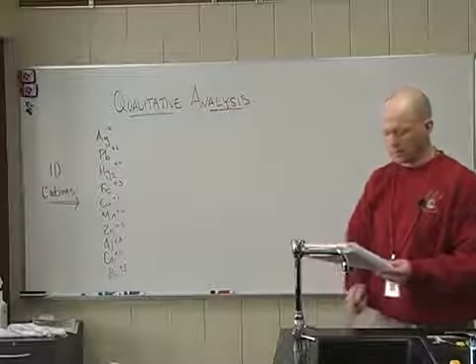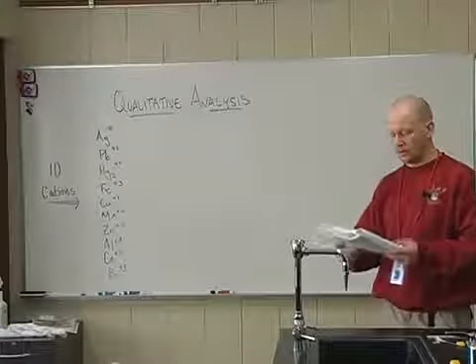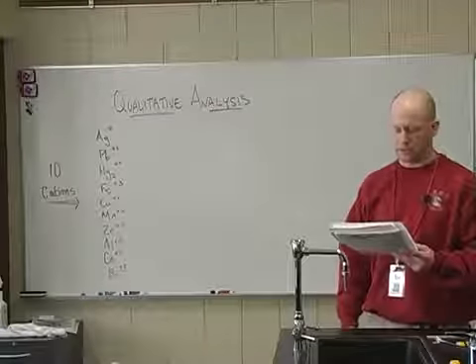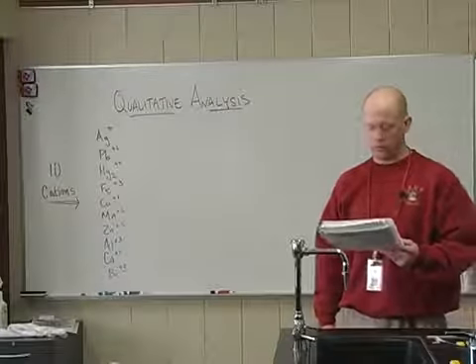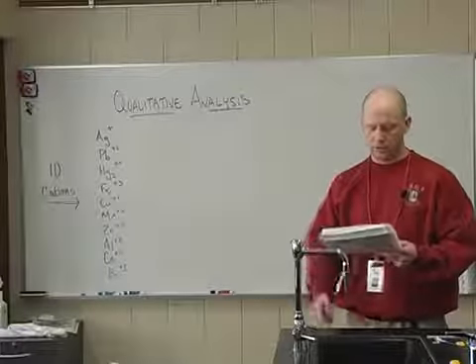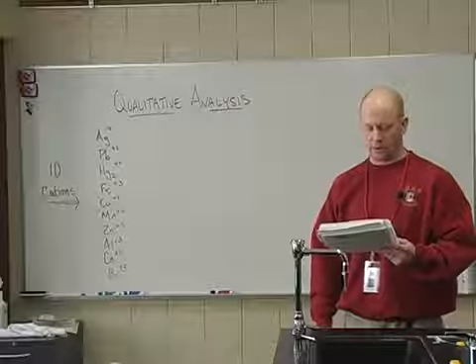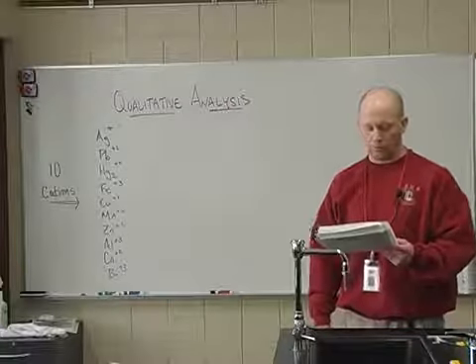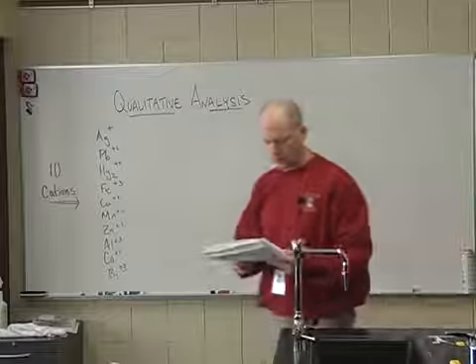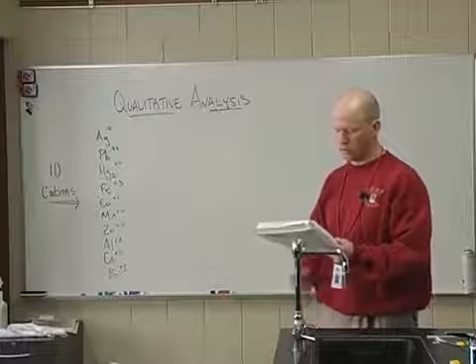Next section, general techniques for qualitative analysis. Keep good records. It's necessary to keep good records so that you don't get confused and forget what solutions are in which test tubes. Number your test tubes with a pencil or permanent ink so the numbers don't come off in a hot water bath. You should be able to write on the white spots of the test tubes. Maintain a current record of your work. Don't trust your results to memory.